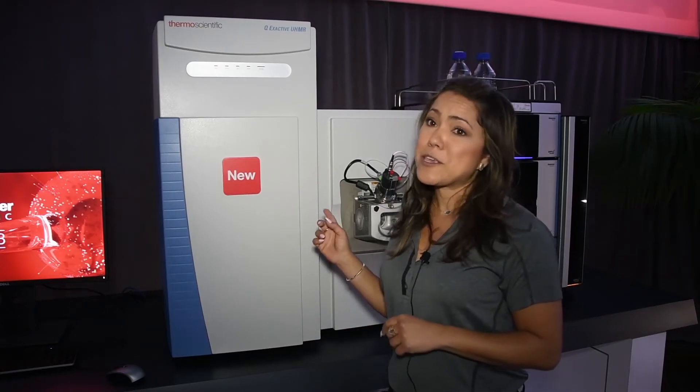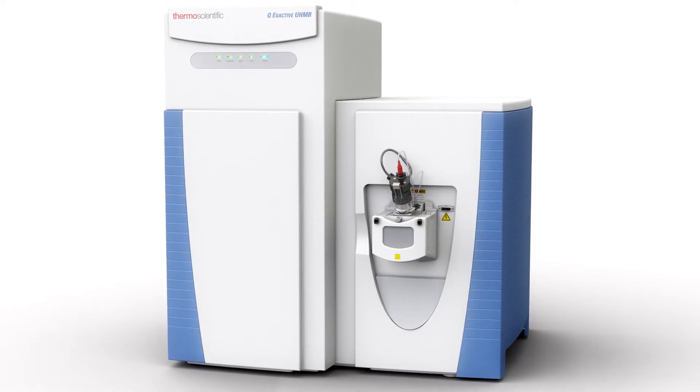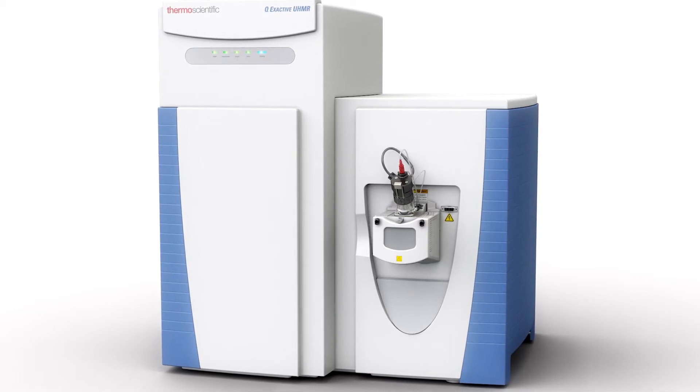With the QE UHMR, you'll be able to do native MS and MS-MS, as well as native intact top-down proteomics and all of your biopharma workflows.